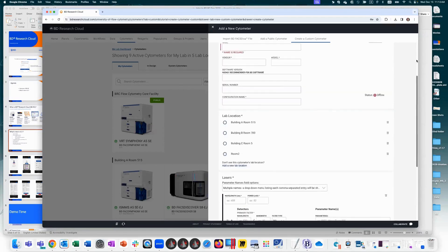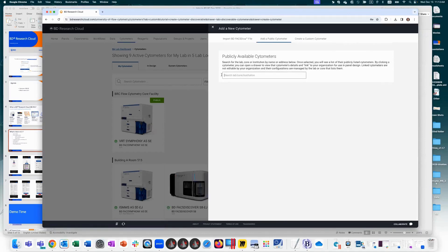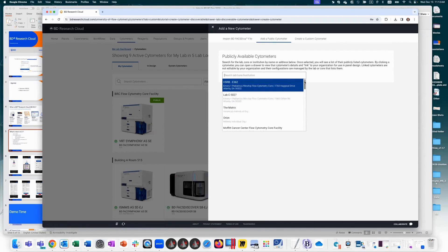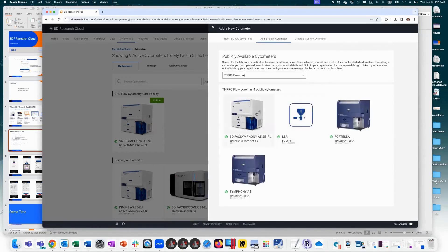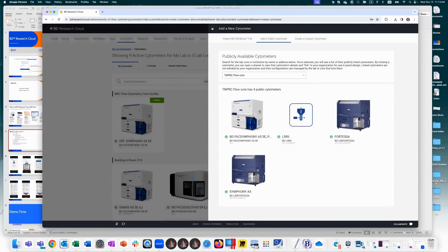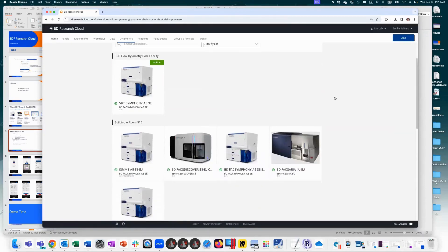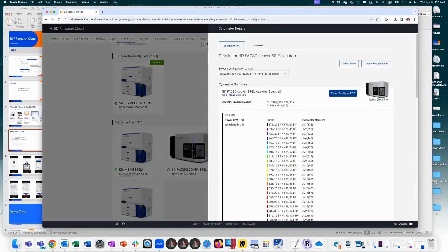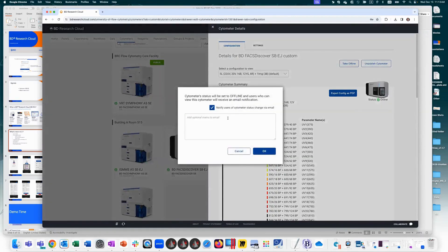As a core lab user, you can search for your core lab, see which cytometers are available, click one, and press link cytometer to have that configuration available to you. As a core lab manager, you can send notifications about a cytometer — for example, take it offline with a message like 'cytometer down for maintenance,' which automatically notifies all users who have that cytometer linked to them.